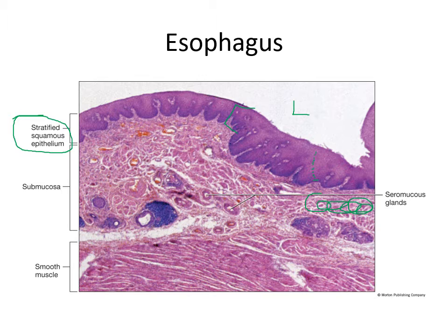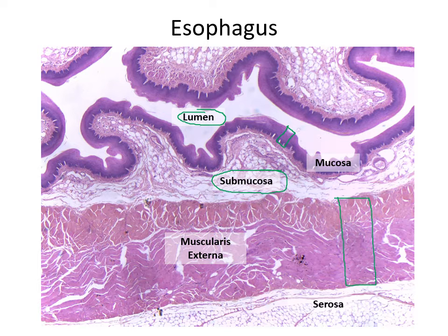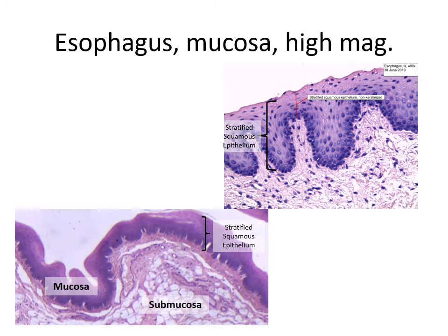Let's take a look at some other images of the esophagus. Here's one where we can see it in its entirety. We have the lumen here in the middle and there's nothing in the esophagus so it's kind of squiggly and collapsed. Here is our mucosa, which is our stratified squamous epithelium. Here's the submucosa which is connective tissue and glands, and then here is the muscularis externa which has two different muscle layers in it, and the outermost layer of connective tissue is our serosa. At higher magnification we can see the nuclei of those individual cells quite well, and remember that by the time they get to the top they are those flat fried-egg-like shaped cells, which is why it's called stratified squamous.